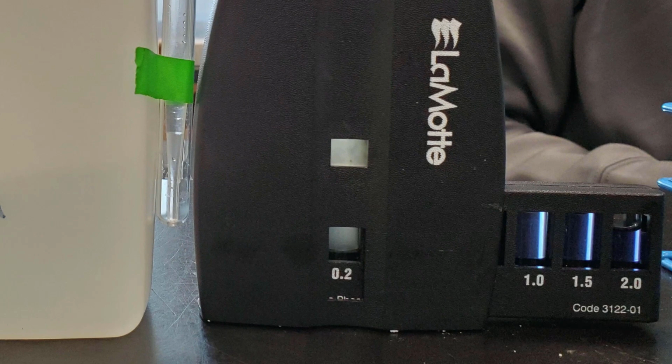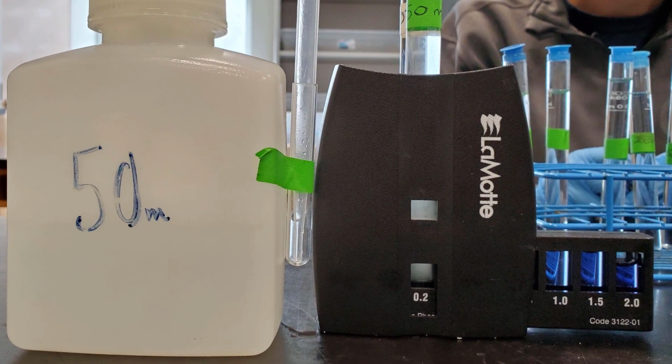Now we have to do this 10 more times for this nutrient, once for each depth. Lucky for you, we did all of the sample preparation, and you just have to take the readings, with the depth of each reading written on the bottle on the left.